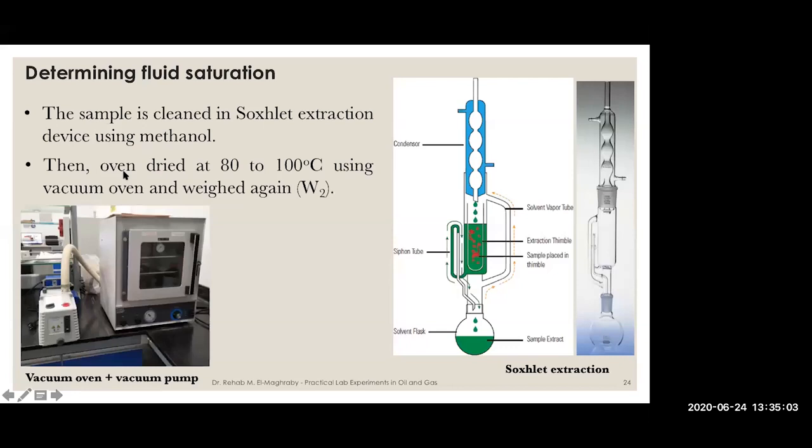You will keep the core plug to cool down, and then you will weigh your core plug. Now it is W2.